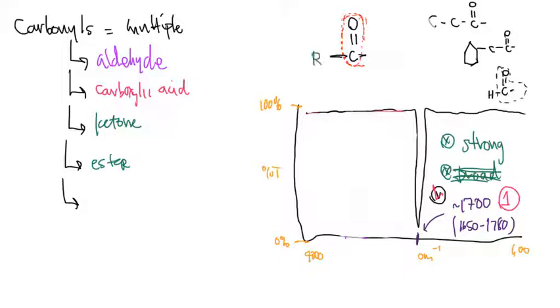So there is a random alkyl group that sits over here to the left and a random alkyl group that sits over to the right. Okay, the aldehydes had a C double bond OH, right? The carboxylic acid had a C double bond O OH. The ketone is actually in between two carbons.